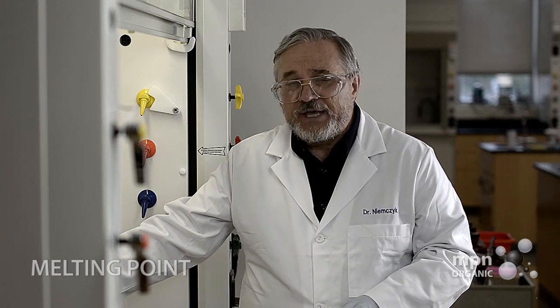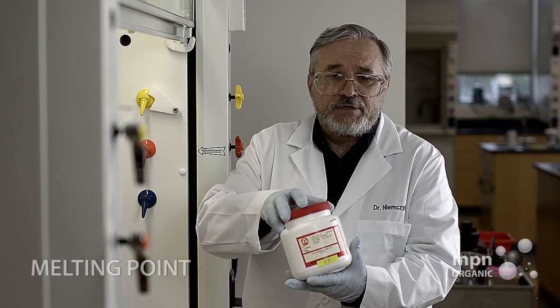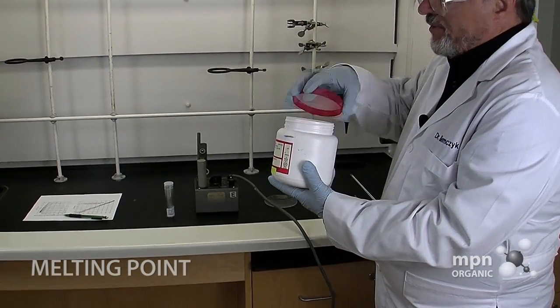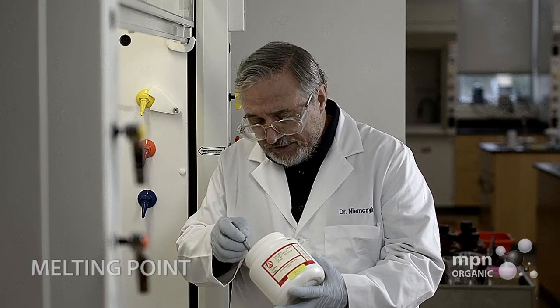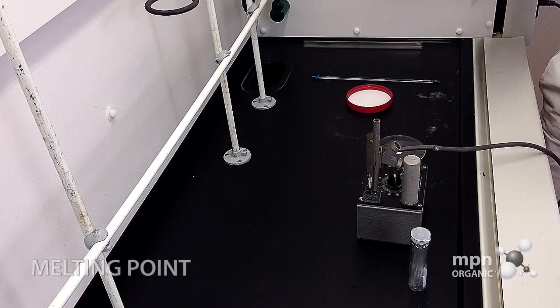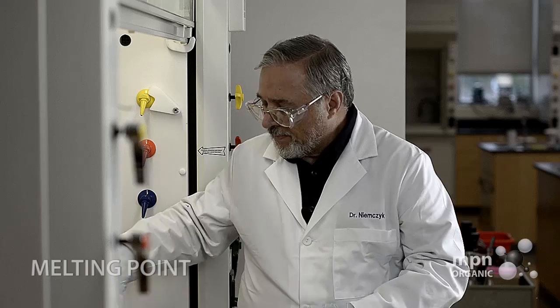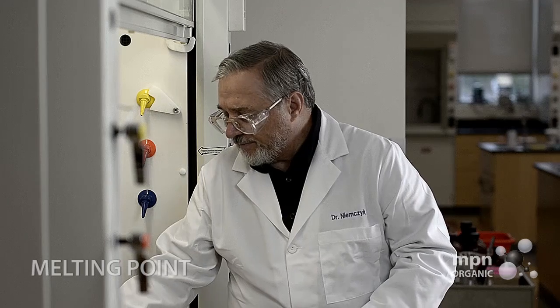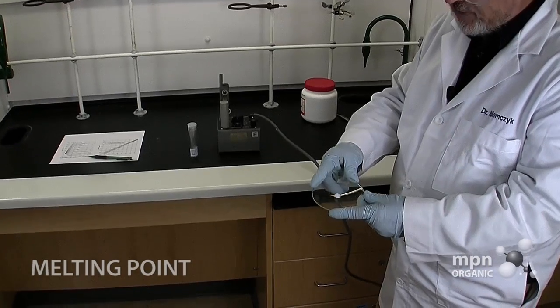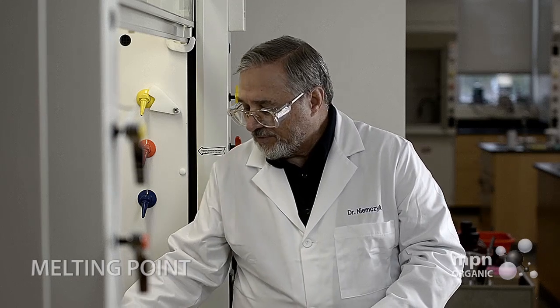And I decided that for this demonstration I'm going to use transcinnamic acid, which comes in a large container like this. We're certainly not going to use all of this, but we're going to take a little bit and put it on a watch glass here. I like transcinnamic acid because it's nice and dry, and it's nice and crystalline, and it's within the range of our equipment. Now, there, so we've got this much on a watch glass. Okay, that would suffice for 25 melting points at the amounts that we use.